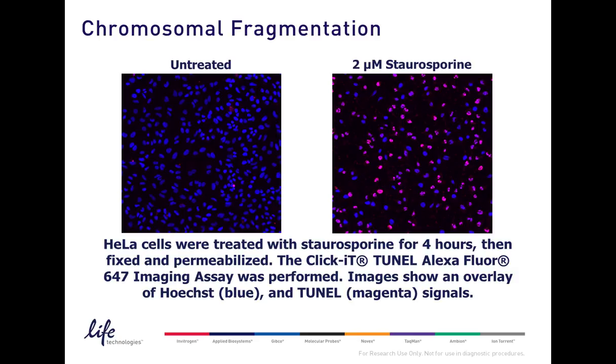And the primary advantage of EdUTP over BrdUTP is speed. The click reaction is complete within 20 to 30 minutes versus a BrdU assay, which can take several hours to 24 hours at an extreme.